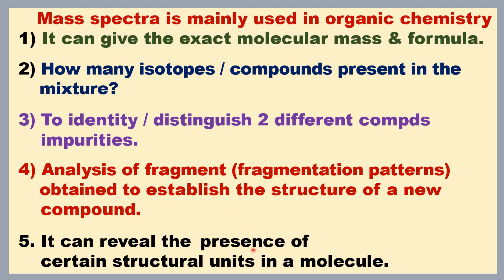It can also reveal the presence of certain structural functional units present in a molecule.